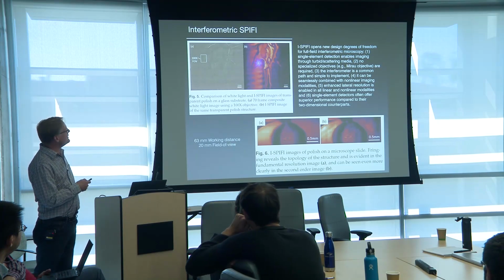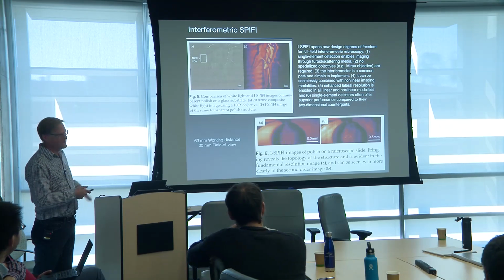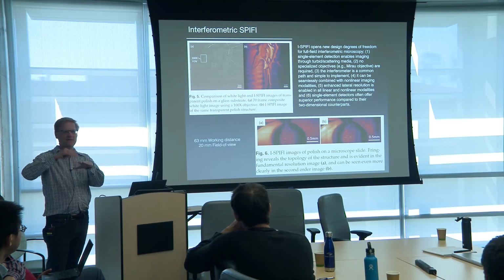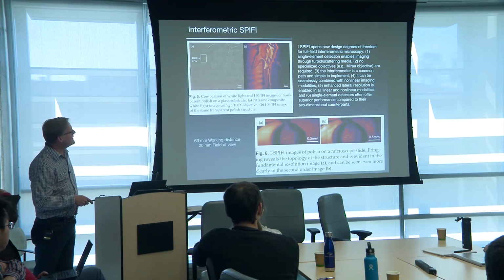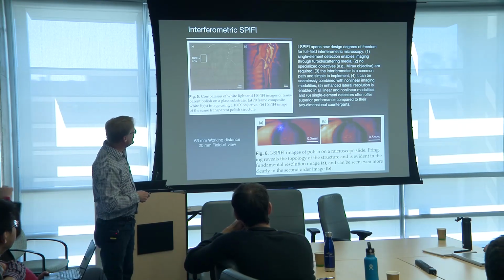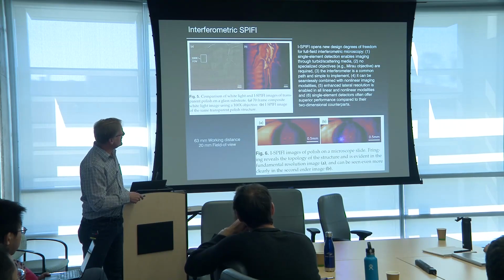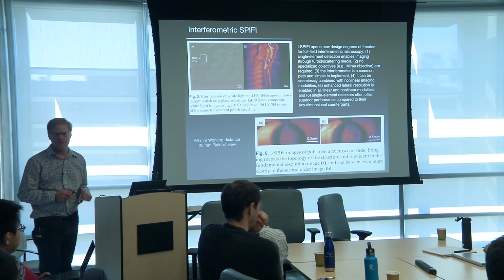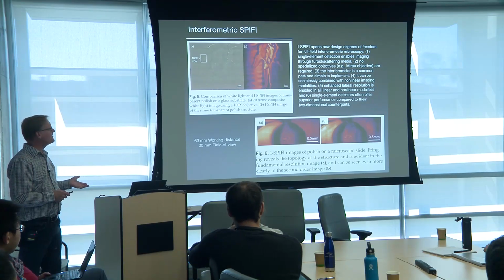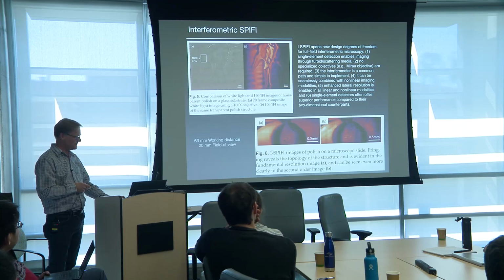What's interesting now is if I zoom in on these, I've got the Z resolution built in, so I can actually see interference fringes there. This one is the first order image. Here's our second order image of that, and you can track the fringing out to even greater depth, and we use that as well as we go out a little bit higher. Okay, and there's my working distance and field of view.